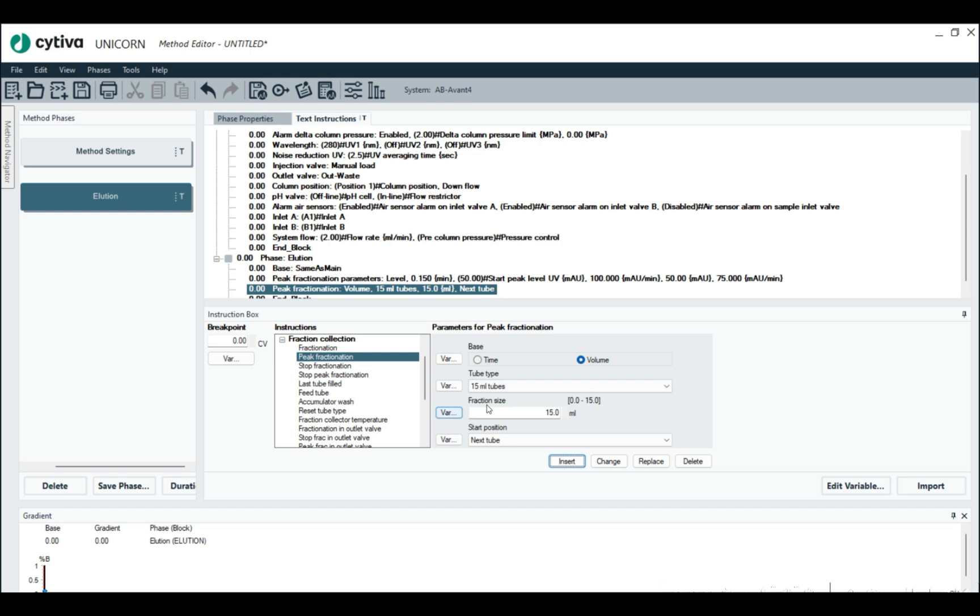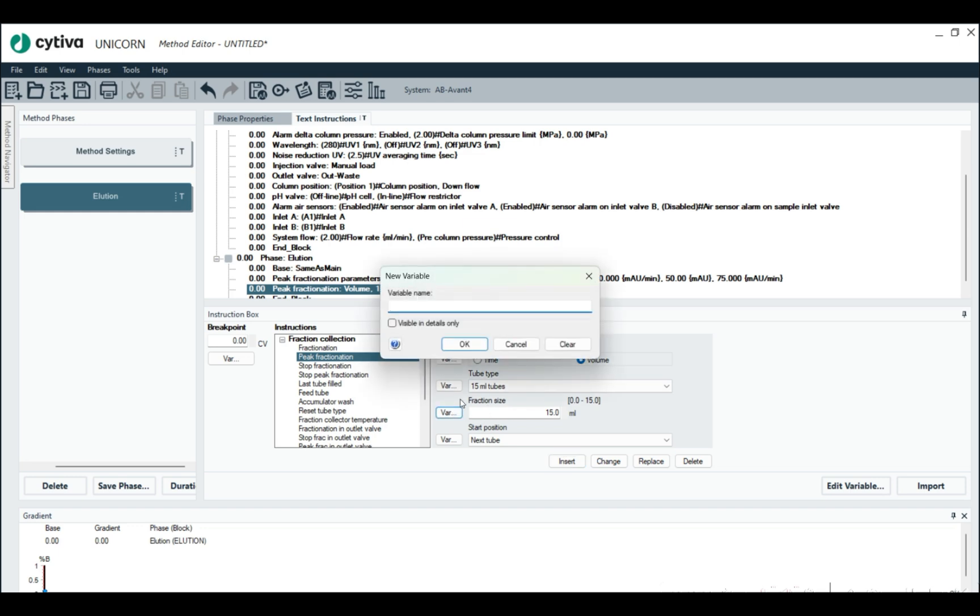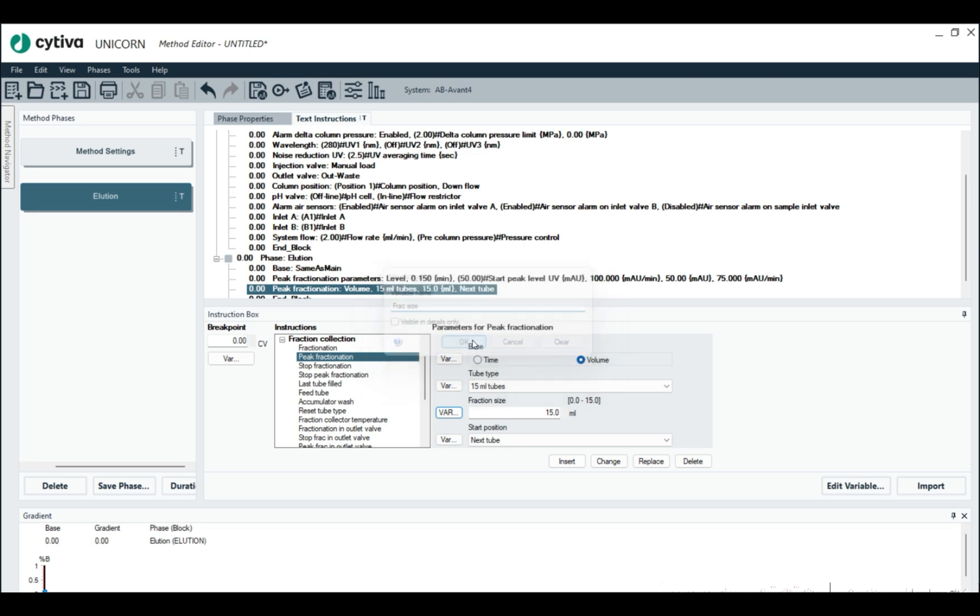We could make, say, frac size. We could also make this a variable as well, if we wanted to. Okay. And then hit change.